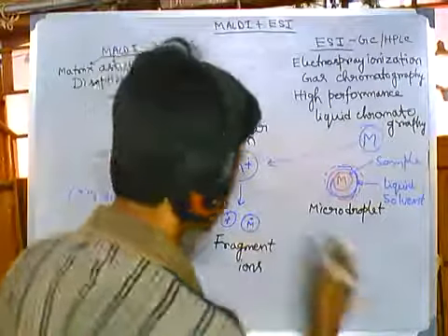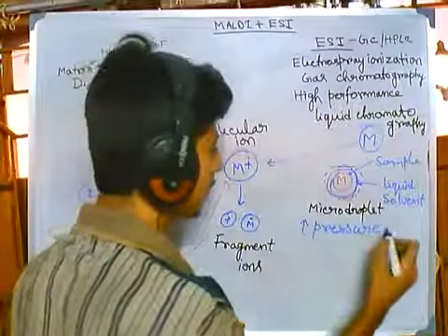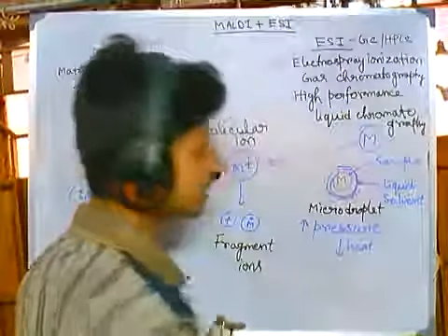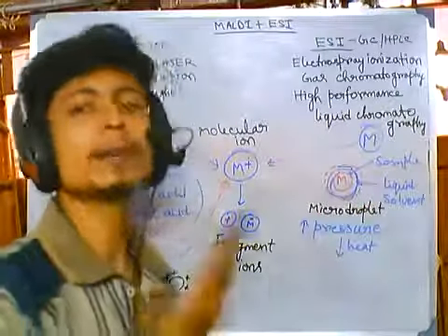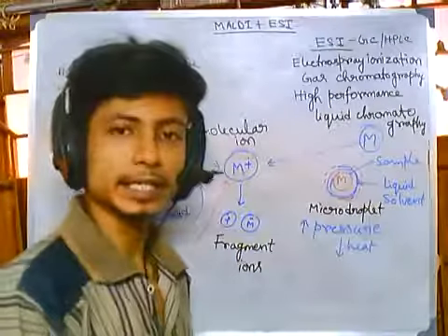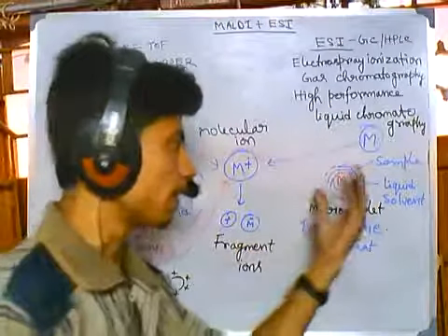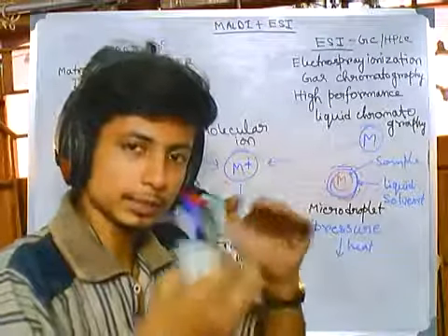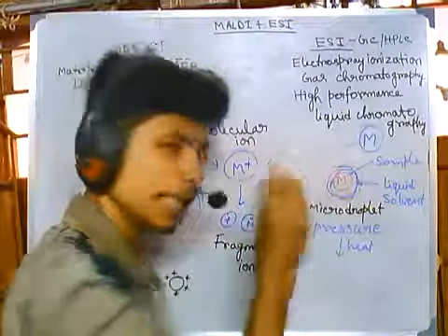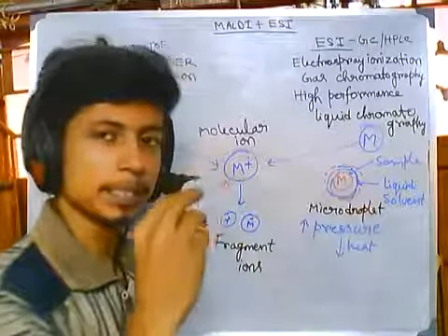Now the high pressure provided in the source region will eventually heat this micro droplet. As it is heating this micro droplet, the micro droplet and the solvents are getting evaporated, right? Because these are the solvents, they are getting evaporated. As this total micro droplet gets into the analyzer, it gets much more heat and evaporates, so very little solvent will be left, and finally we get our molecule, our sample, and the sample is getting ionized.